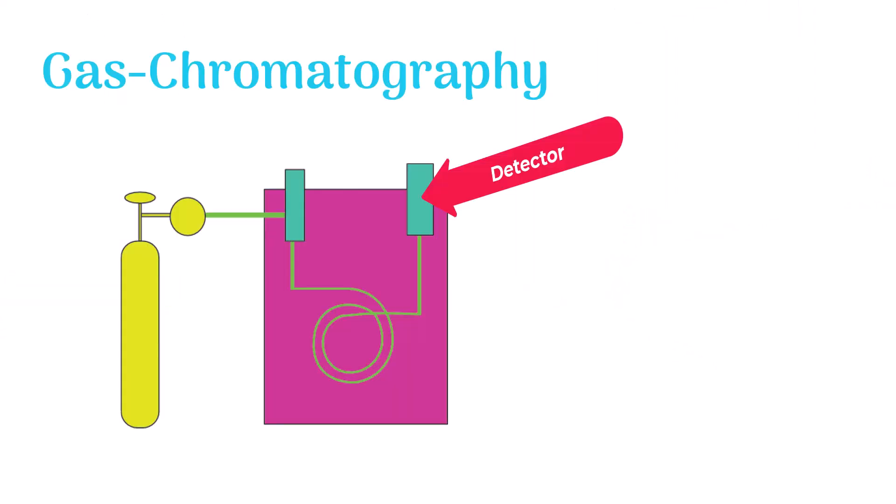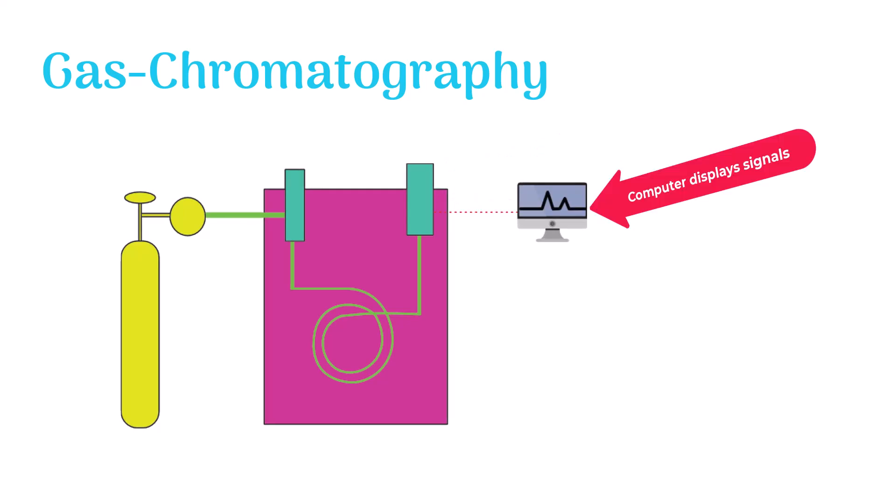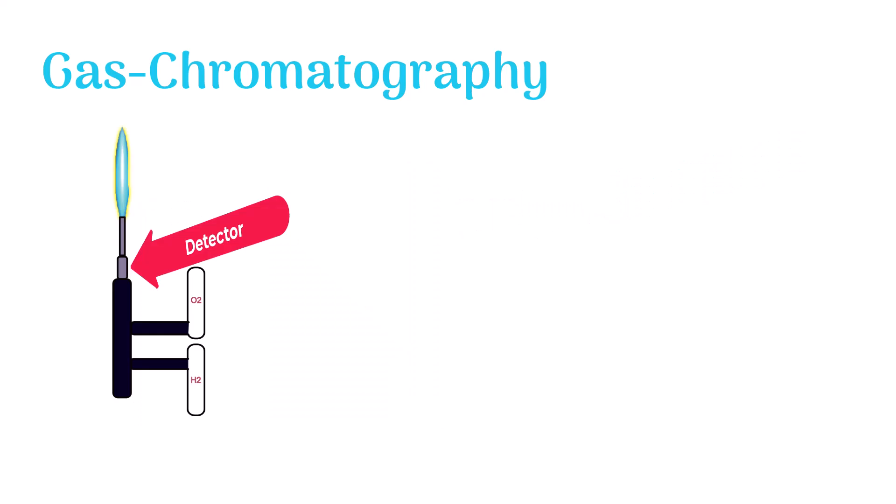The detector detects the sample molecules which are leaving the column. It sends signals to a computer which displays the signals in the form of a graph.